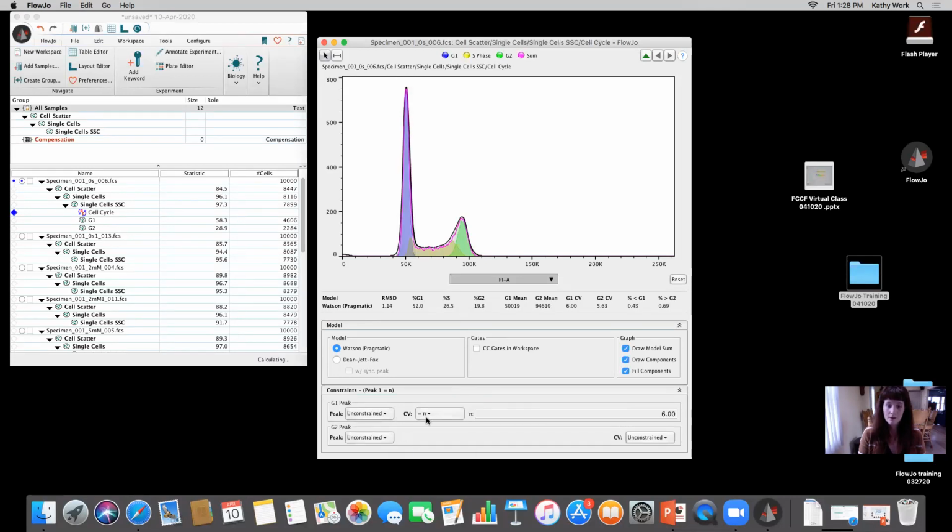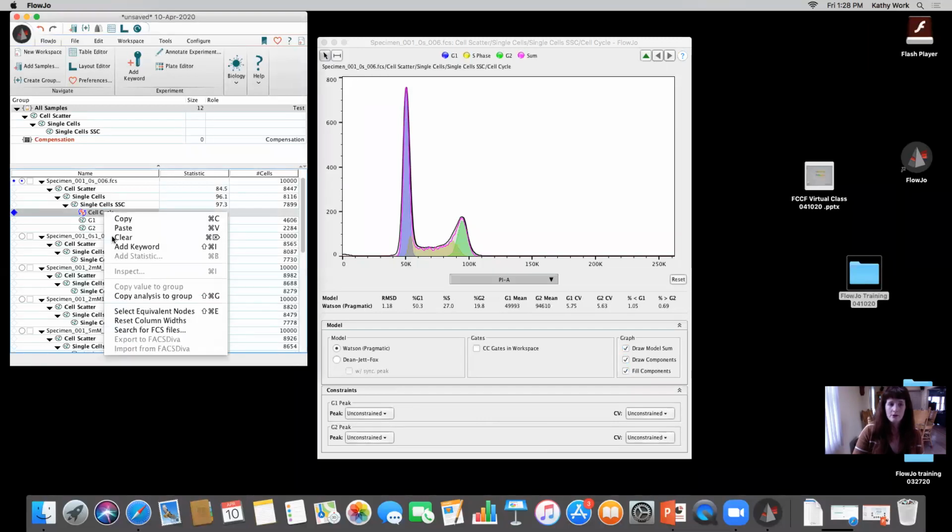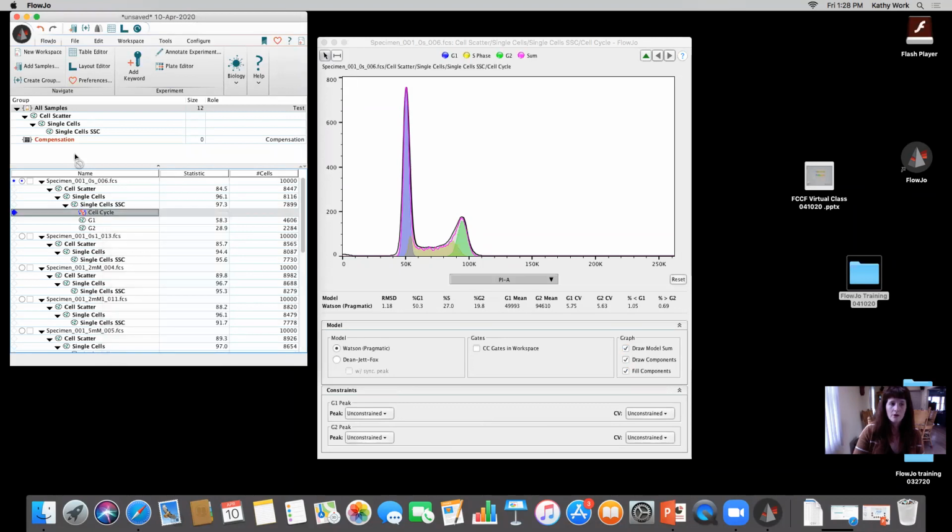And Kathy, while you're doing that, one of the questions that just came up is regarding applying the same settings to all samples, or can we adjust them for different samples? Great question. The next thing that I was actually going to do, so that was perfect timing for that question, is come in here and you can right click and copy that analysis to the group, or you can drag it up to that same population.